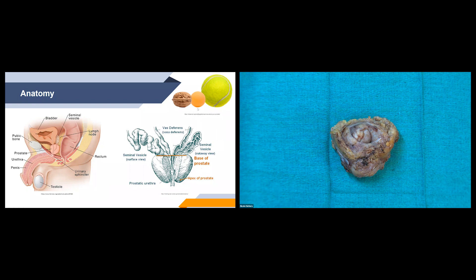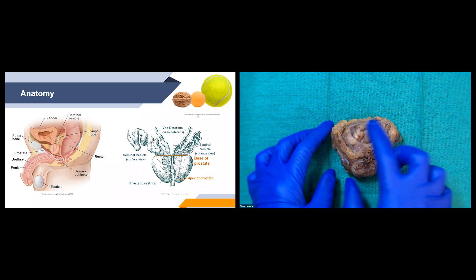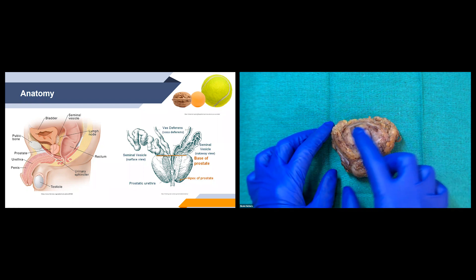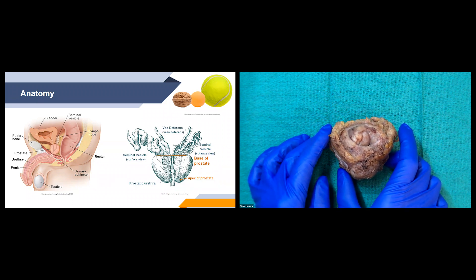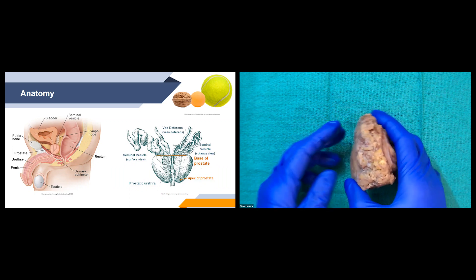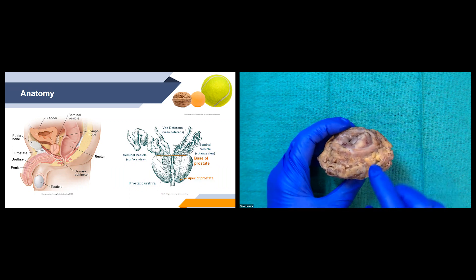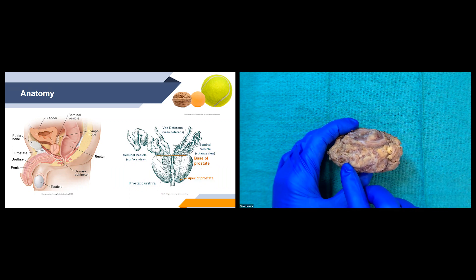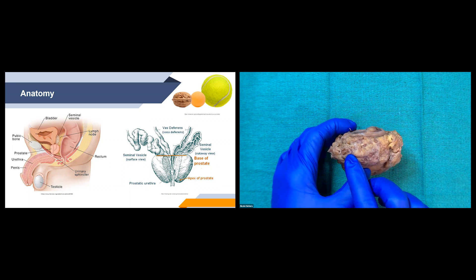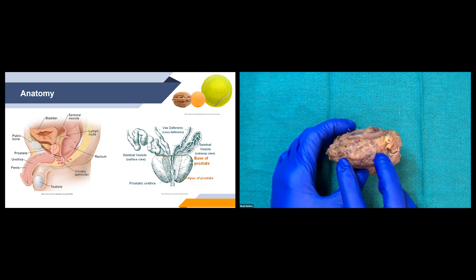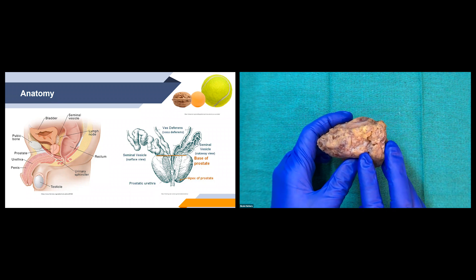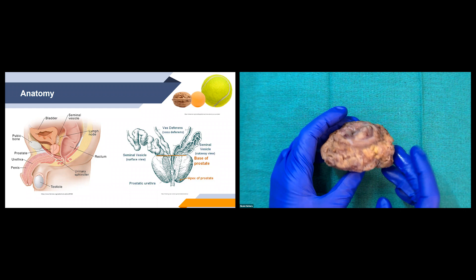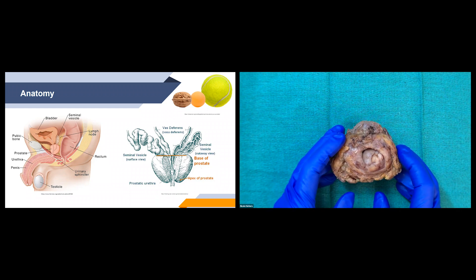With a radical prostatectomy specimen we get our prostate gland, and we'll also get a portion of the seminal vesicles as well as the vasa deferentia. Here you can see the little bits coming off — this one would be our left seminal vesicle and then our right seminal vesicle, which is a bit smaller.